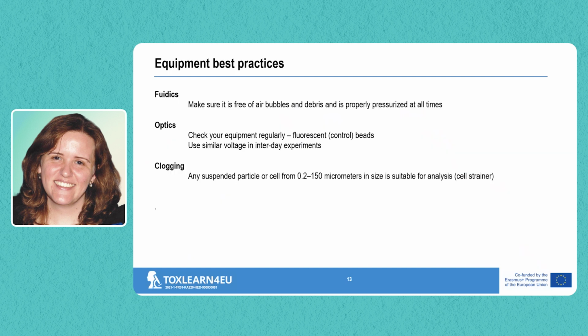So in terms of equipment best practices, if we look at the different components, for fluidics we need to make sure that it's free of air bubbles and debris, and that it's pressurized the whole time. Another fluidics problem is the clogging of the equipment, and this happens very often when you work with flow cytometry.